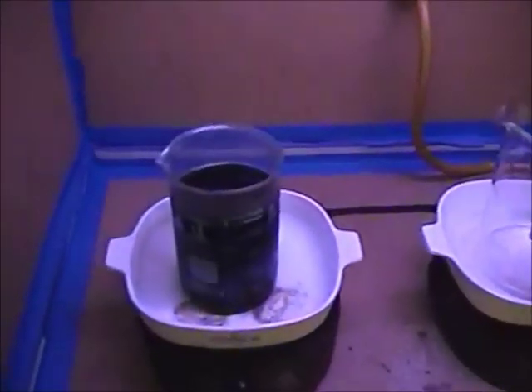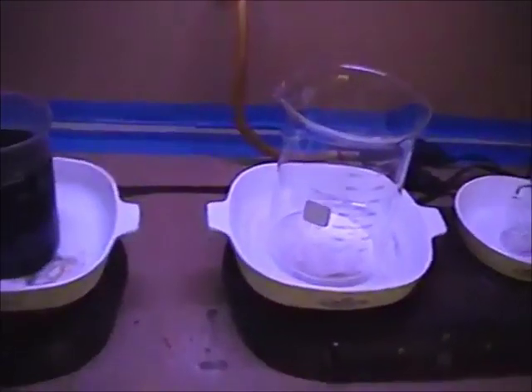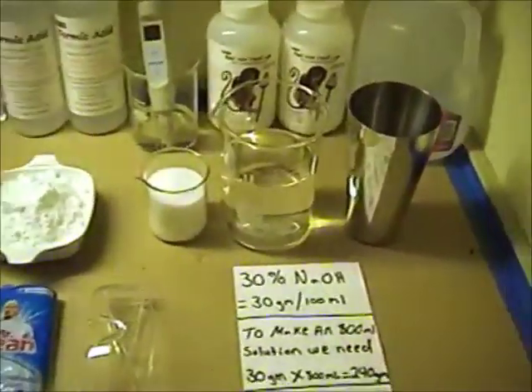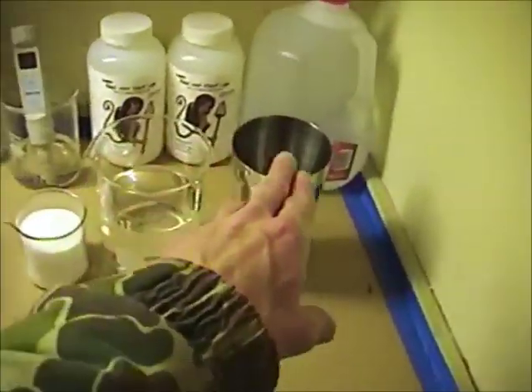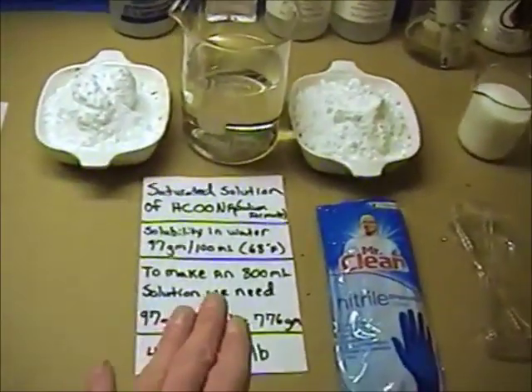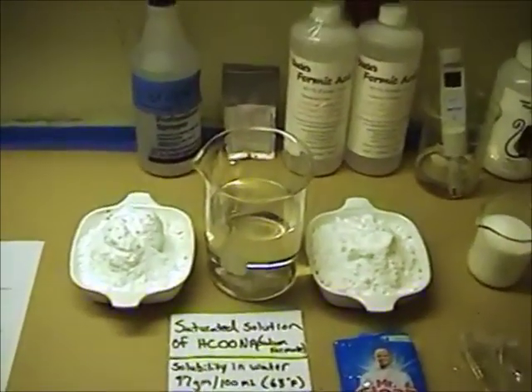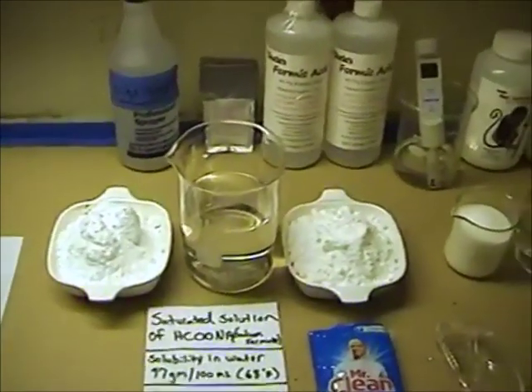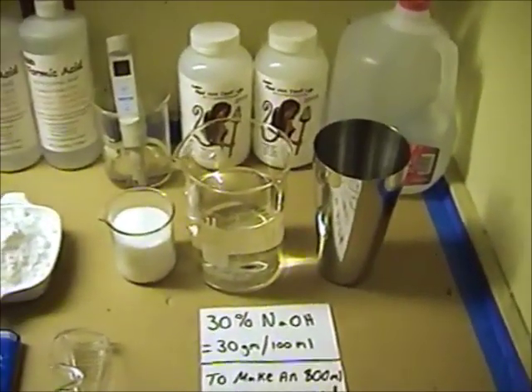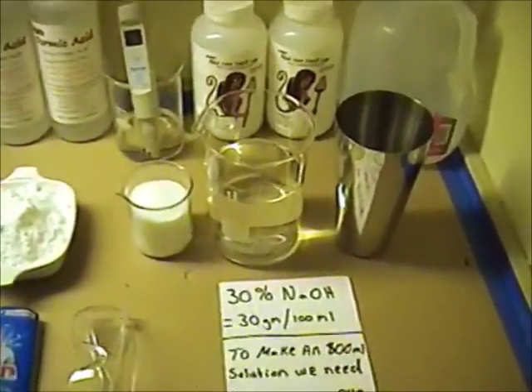What I'm going to do is cut away, and I'm going to transfer this beaker over into our 2,000 milliliter beaker. I'm going to take these and add them to their respective container here, and I'm going to start heating these up and dissolving them. I'm going to cut away for a minute, and once I get all this set up on the hot plates, we'll come back and check in periodically to see how everything's going.